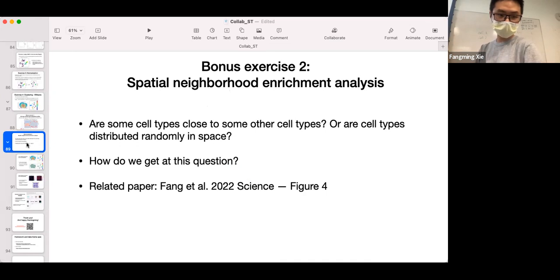But let me talk about the general idea. And I'll hand you the full solution so you can play around with it later. So far we've been playing with gene expression. We've been playing with spatial coordinates. So one unique opportunity of this data set is that we can combine them together and actually make sense of the local environment of the tissues.